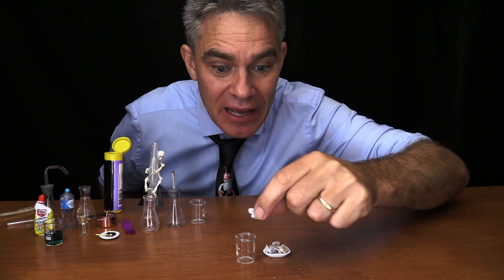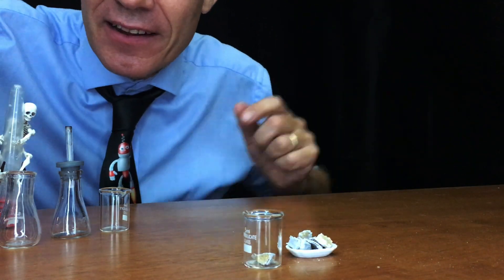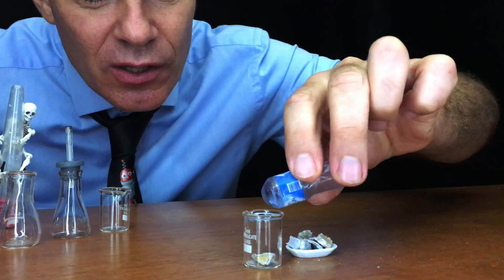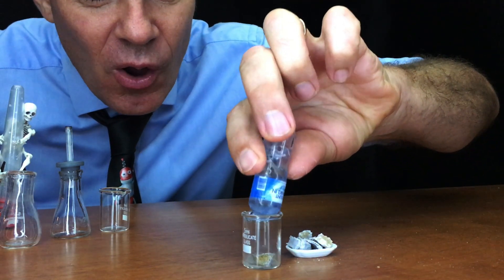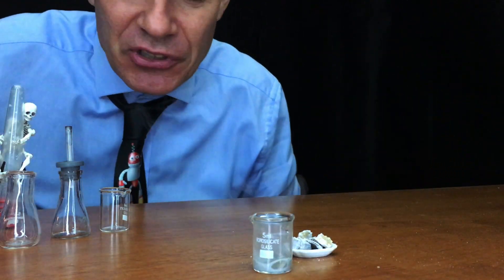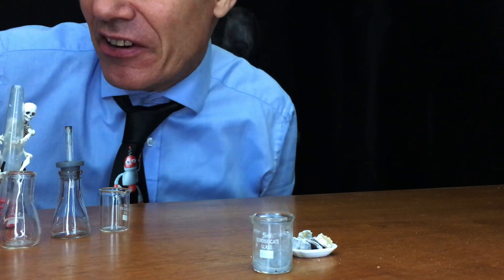I'm going to put a chunk of calcium carbide in this tiny little beaker and then add a little bit of water and let's see what happens. Can you see the gas produced? That gas is acetylene gas and it's very flammable.